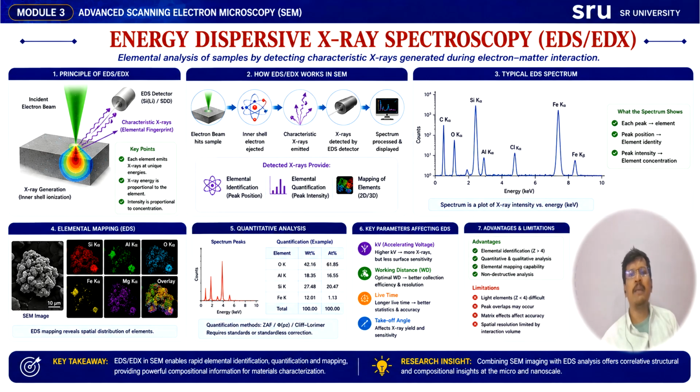While SEM images reveal the morphology and microstructures of the materials, researchers often need to know an equally important aspect: what elements are present in the sample. This is where EDS becomes extremely useful.